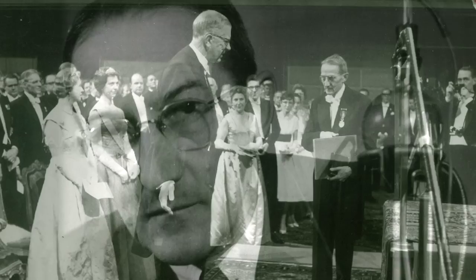It was invented by Jaroslav Heyrovsky, who was for this invention awarded a Nobel Prize in 1959.